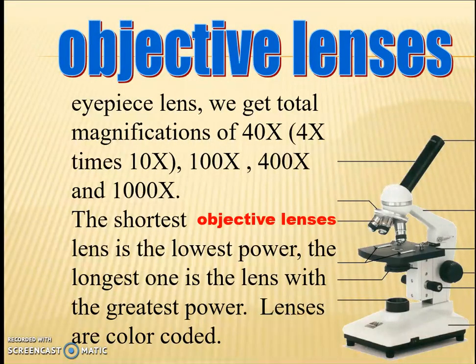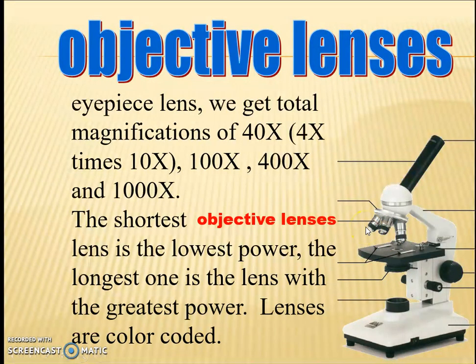When using the microscope, you are going to start with the shortest objective lens at the lowest power, and gradually work your way up to the greatest power. These lenses are also color coded for easy identification.